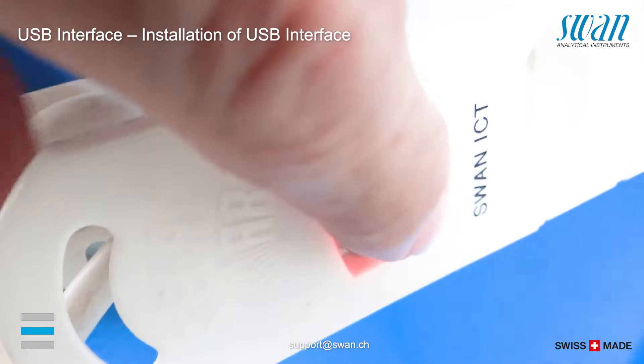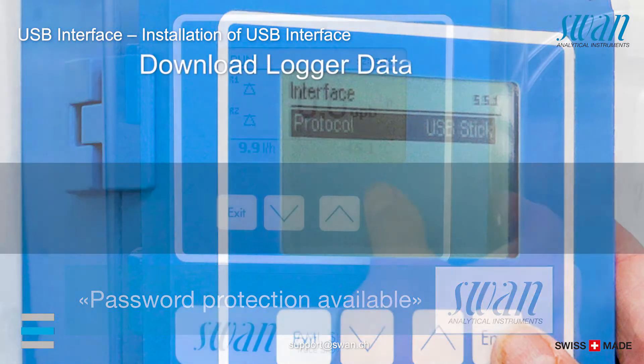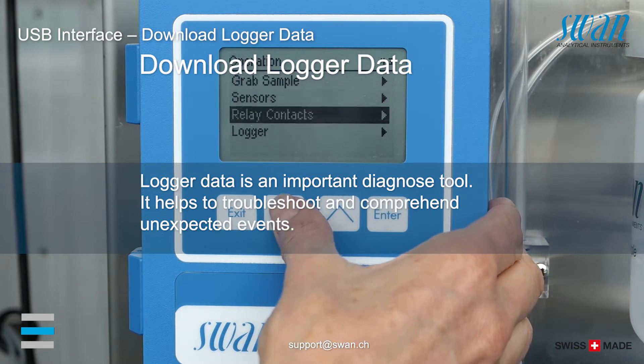After installing the USB interface, it is automatically recognized and indicated in the installation, operation and diagnostics menu. To remove the USB stick with the logger data, we recommend the following procedure.